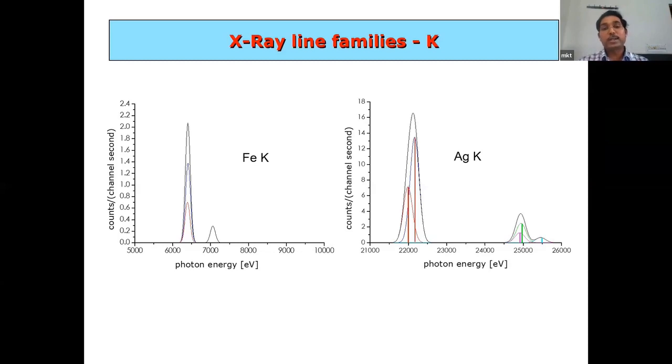Now, the X-ray fluorescence lines you already have. If you analyze all these things, then you can say this is a very complex spectrum. Normally, for the Fe K line, for example, there are K alpha and K beta. Fitting is also very important. If you want to do the analysis, it's very important to precisely analyze the fluorescence peak area. And you see this is K alpha, it has two peaks, K alpha and K beta.